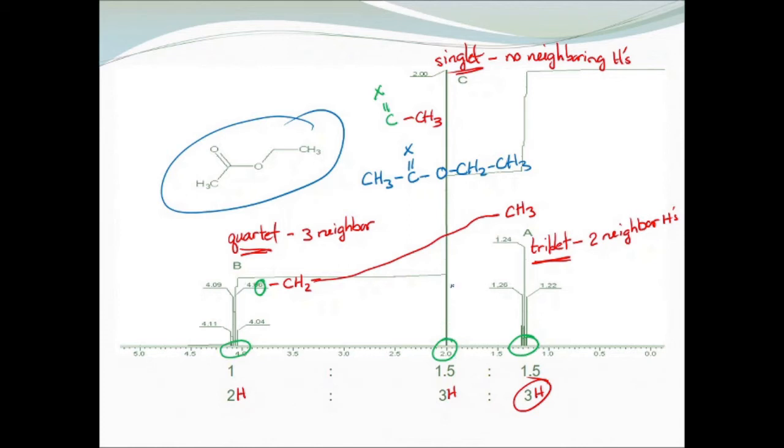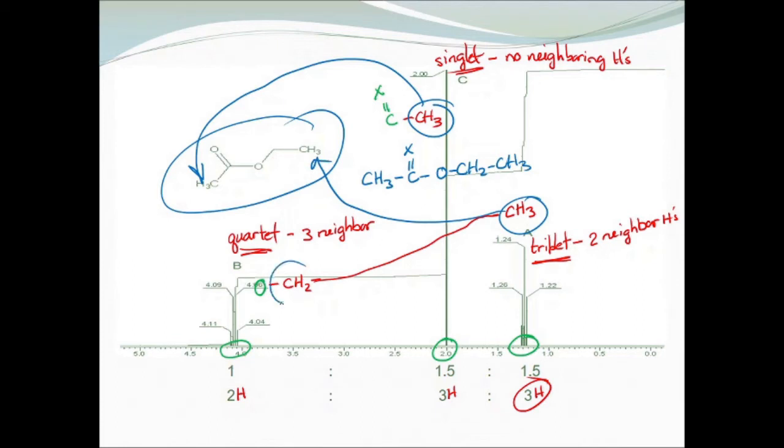And the peak at 1.5, this methyl group is in fact this one. This CH3 is this one, and our CH2 is that one right there. What we don't know from NMR is what the nature of the X is, but that's given here that it is indeed an oxygen. But from the NMR, you'll notice that we can get nearly an entire structure.